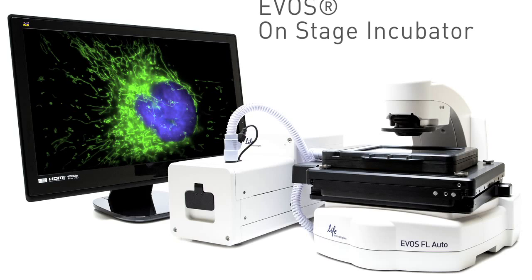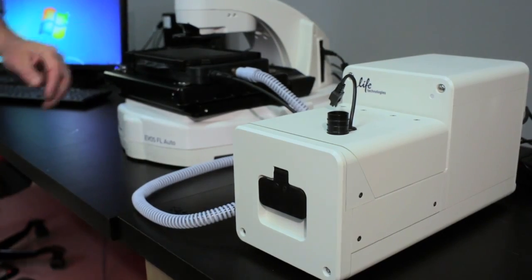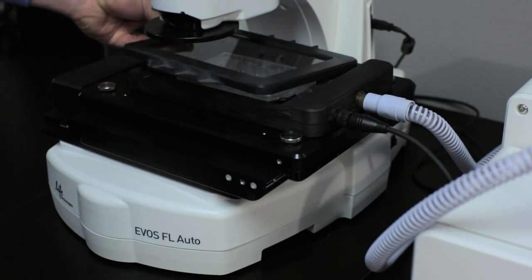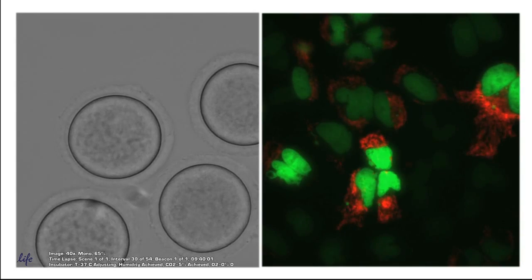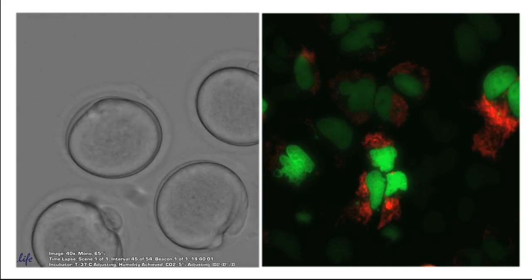The EVOS On-Stage Incubator is an environmental chamber designed specifically for the EVOS FL Auto Imaging System. It enables precise control of temperature, humidity, and three gases for time-lapse imaging of live cells under both physiological and non-physiological conditions, like hypoxia.